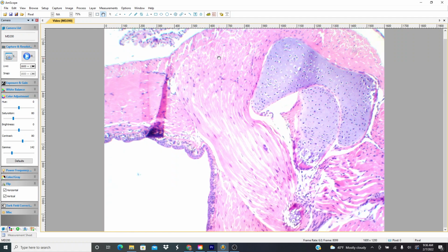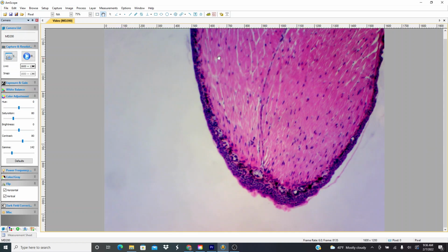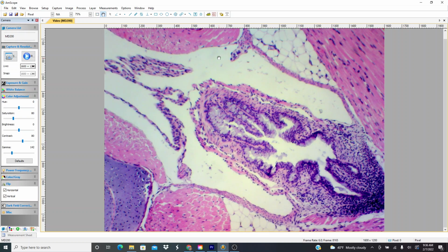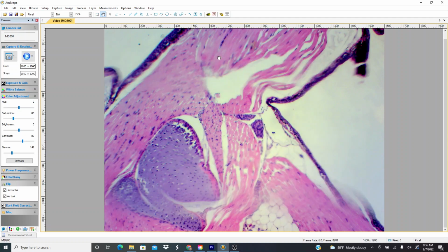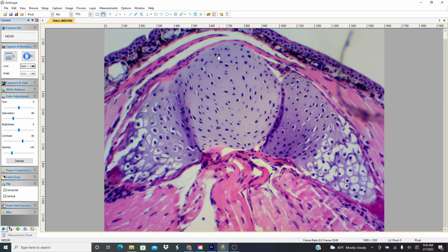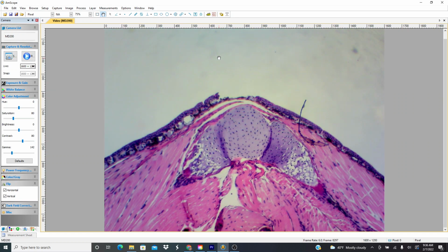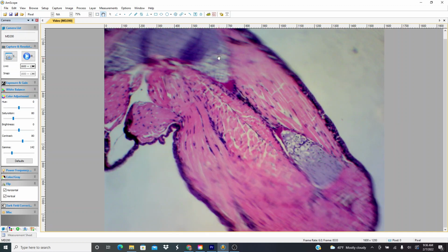Let's go on low power again. Kind of go down this leg. Looks like we didn't quite cut into the cartilage on that one. So then, this is the other side, this other ball and socket joint in this leg. And this is, I guess, the knee. Interesting. I wonder if this is a patella. Do they have a sesamoid bone there, which is a free-floating bone like the patella in humans? I'm not sure. We'd have to cut again to see. And then it kind of stops there.